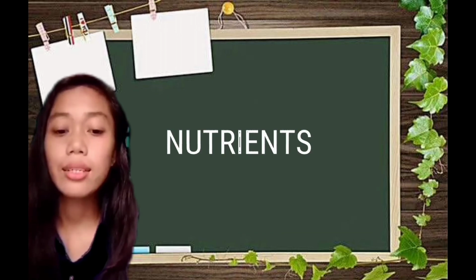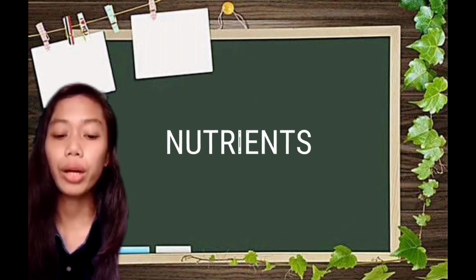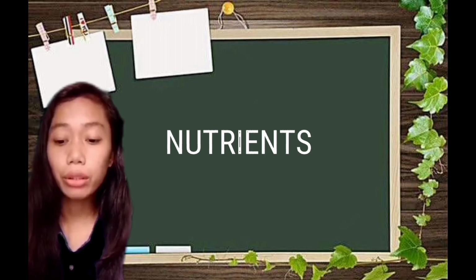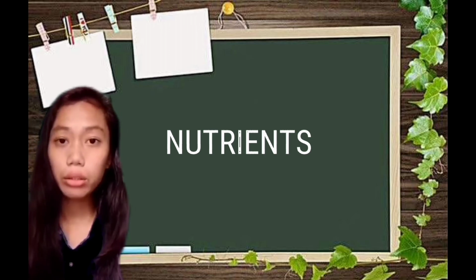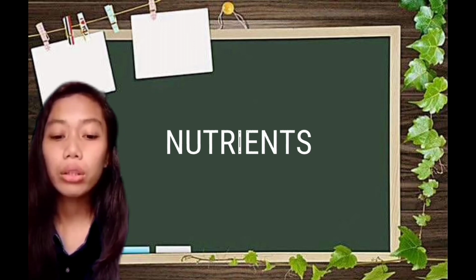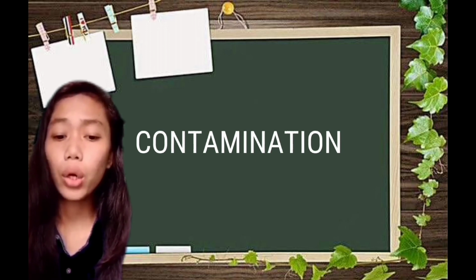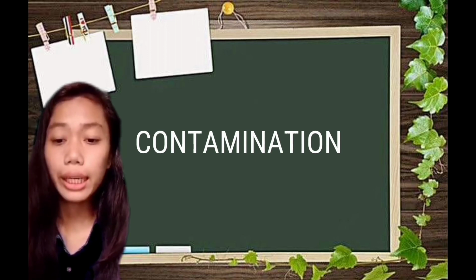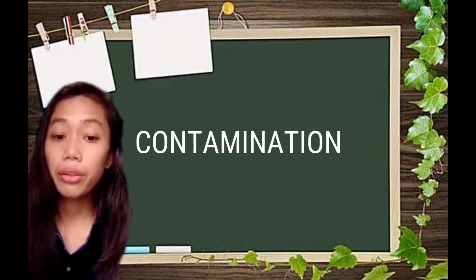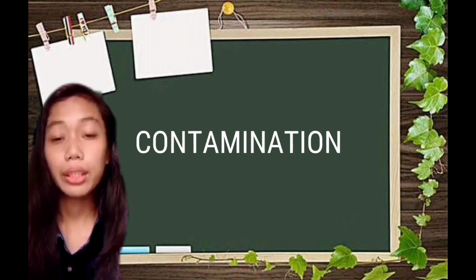The nutrients. Check the record for the last time the culture received nutrients. This is particularly important for semi-continuous cultures. And lastly, contamination. Are the walls of the culture container, particularly at the water and air interface, visibly fouling or filled with what appears to be detritus?